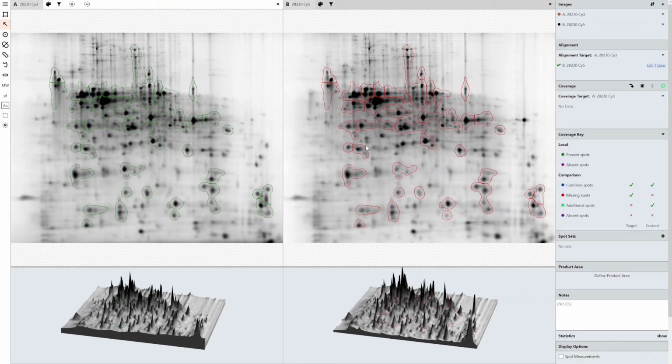So without further ado, the first thing I'm going to guide you through is image aliases, image nicknames. Now, when you get your images from your scanner, be it a Cytiva Typhoon, an Azure Biosystems unit, a BioRad unit, whatever large format scanner you may be using, it's likely that you're going to get them in something like this.